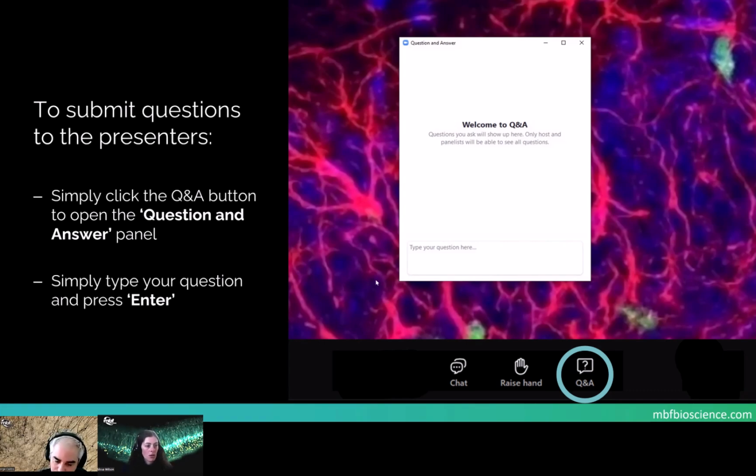And there's a question about the computer requirements. We have the recommended specs on our website. If you go to the MBF website, we have a Stereo Investigator AI page, and the recommended computer specs are on there. Or you can send us an email and we will be happy to provide that for you.